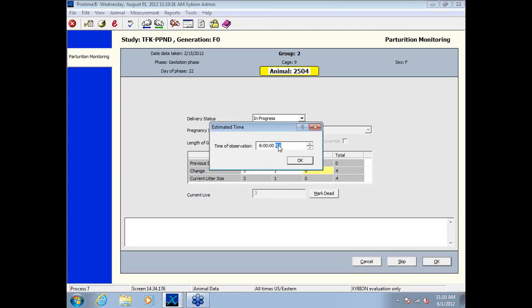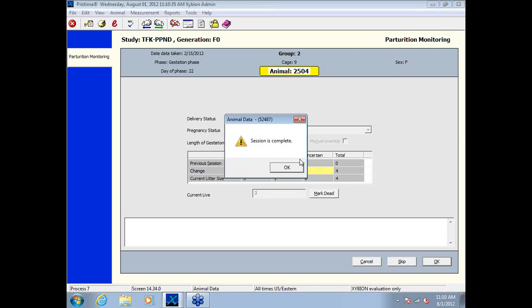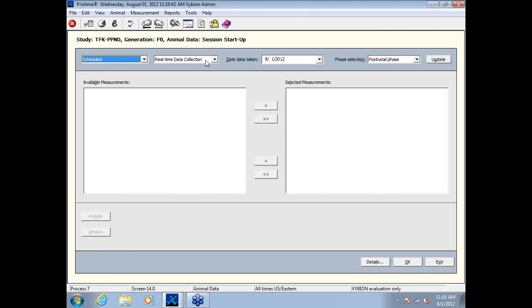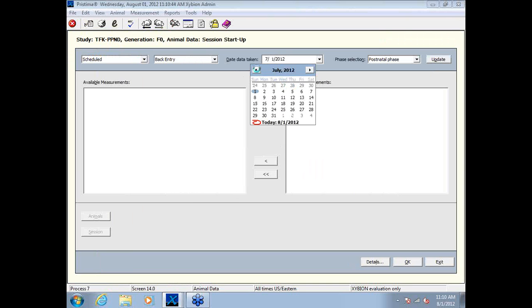Again, because I'm back entering, it's asking me for a time. And then we'll go back in for the next day.